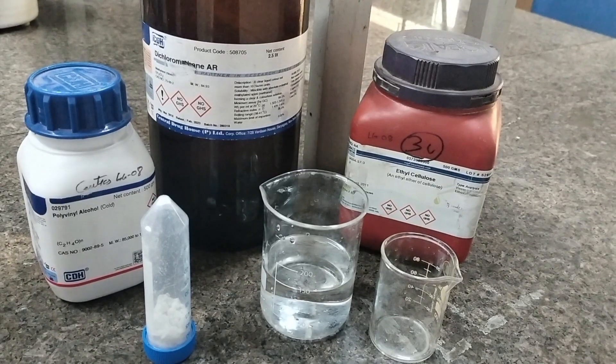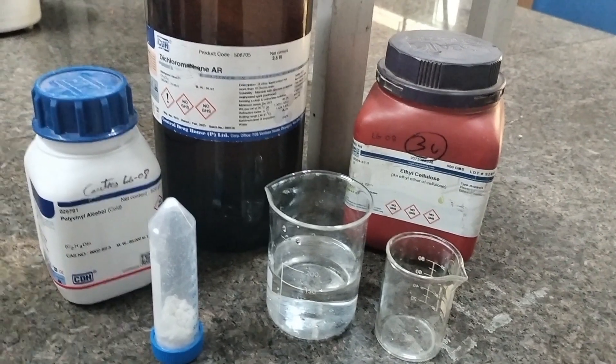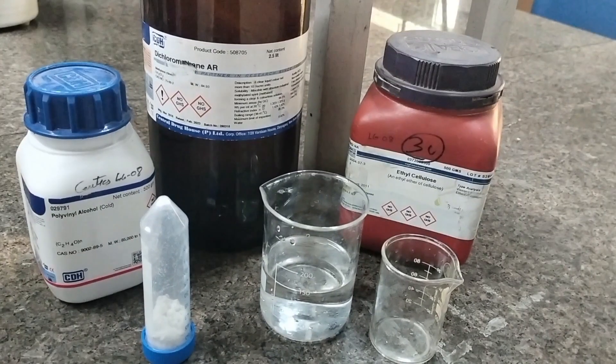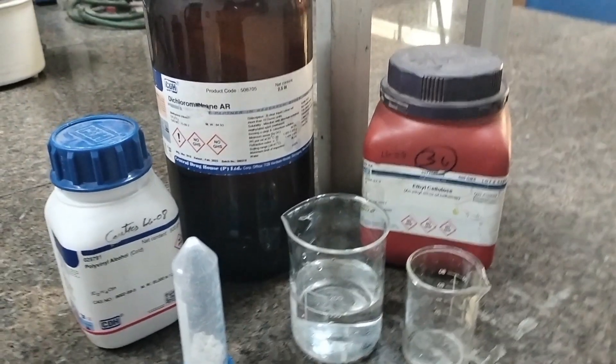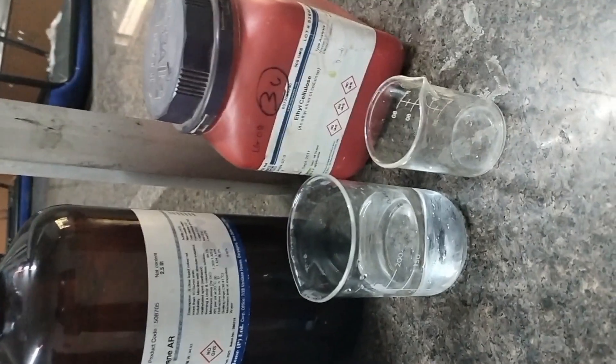Today we are going to prepare micro sponges by the quasi-emulgent solvent diffusion method. For this method, the required ingredients are ethyl cellulose, polyvinyl alcohol, drug, water, and dichloromethane. For this method, first we have to prepare two phases: one is the internal phase and another one is the external phase.